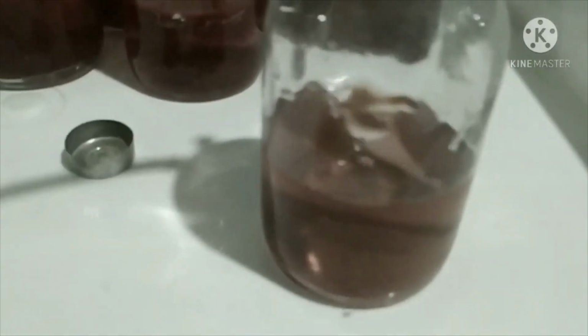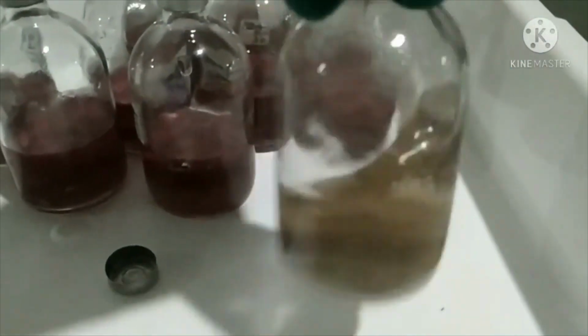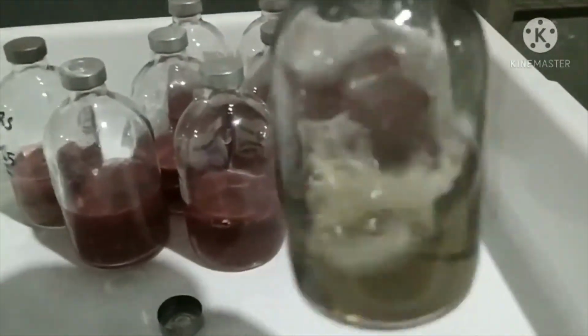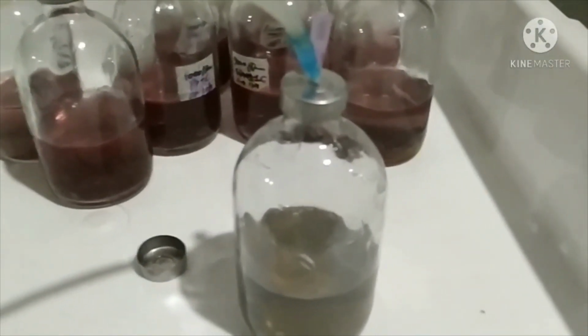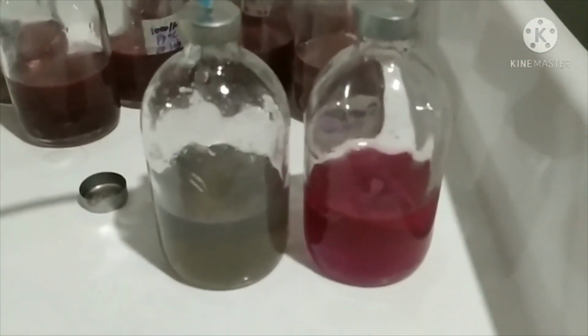It will retain the media color again. Now you can see how it has changed, and the total transparency of the color. And you can compare the aerobic and anaerobic color.